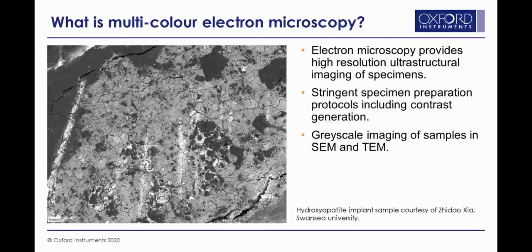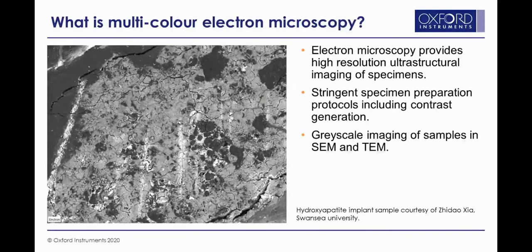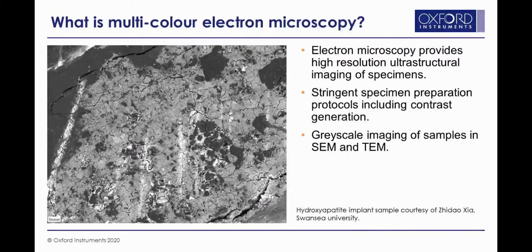The sample on screen is the planed face of a resin-embedded hydroxyapatite bone implant in the process of degradation, imaged using an SEM. It was hoped that heavy metal staining would provide enough contrast difference to see cellular material. But apart from one distinct cell in the centre, it is quite challenging to differentiate between the implant and the tissue because of the grayscale nature of SEM and TEM imaging.